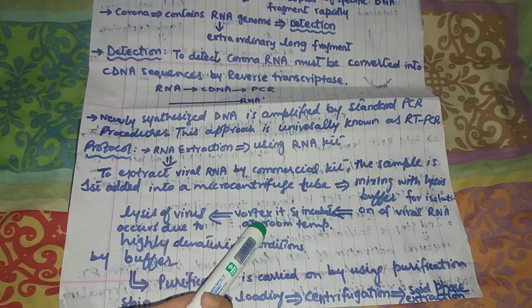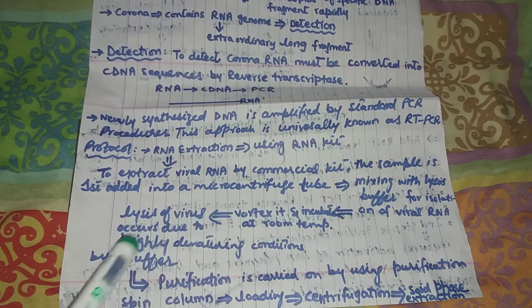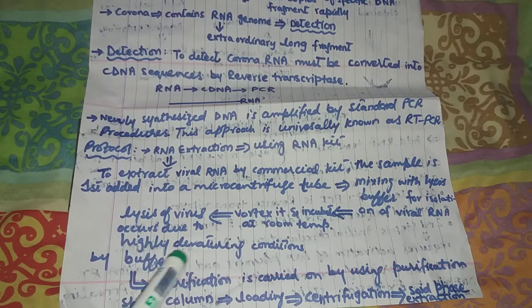After vortexing and incubation, the lysis buffer has caused our viral RNA to come out of the virus. This lysis buffer has a denaturing nature, so under these denaturing conditions, lysis of the virus occurs.